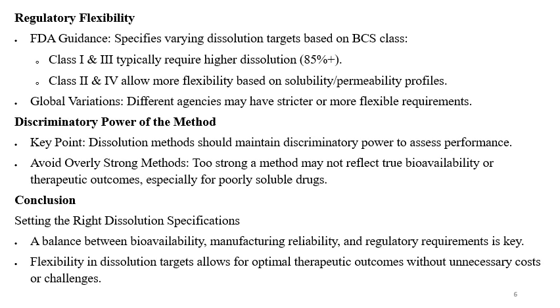Now relate these things to the discriminatory power of the method also. The dissolution method should maintain discriminatory power to assess performance. So we should not try for 100% dissolution in all the products and at all the conditions. Avoid overly strong methods. A too strong method may not reflect true bioavailability or therapeutic outcomes, especially for poorly soluble drugs. So it is not like that. If you are not getting 100% dissolution, it will not be effective in vivo. It is not like that, as we have seen in the IVIVC part.